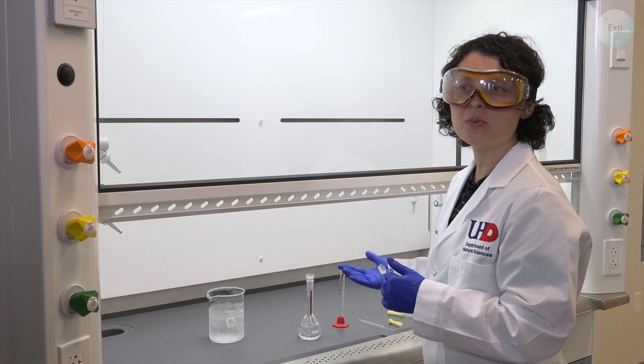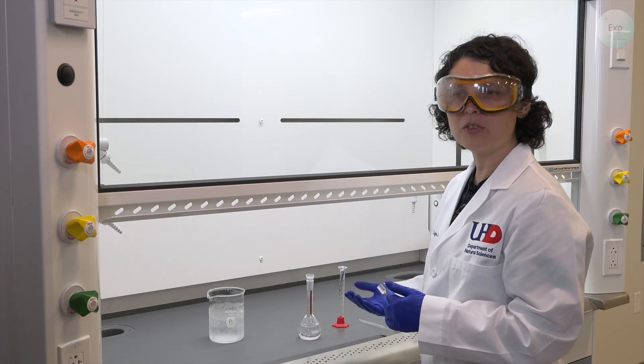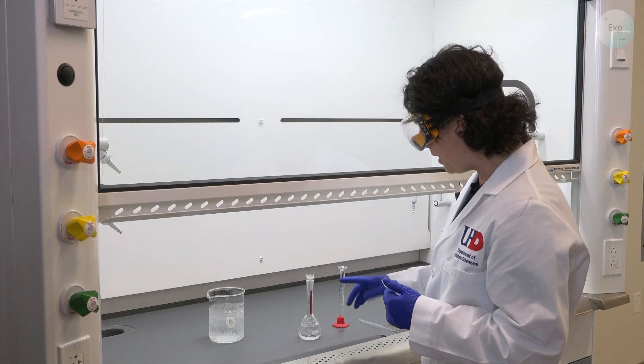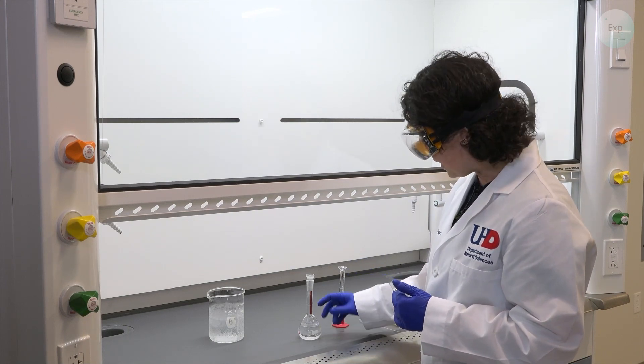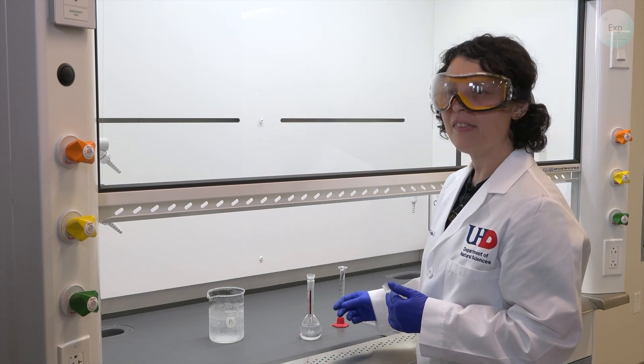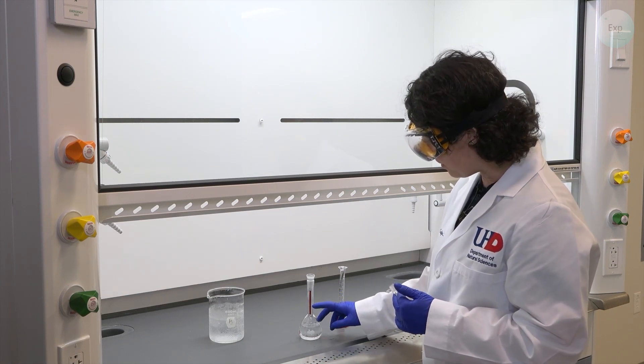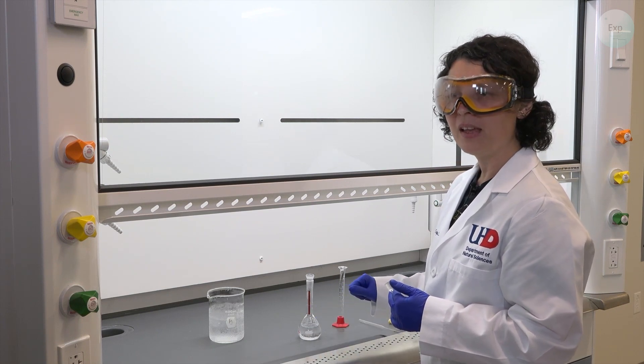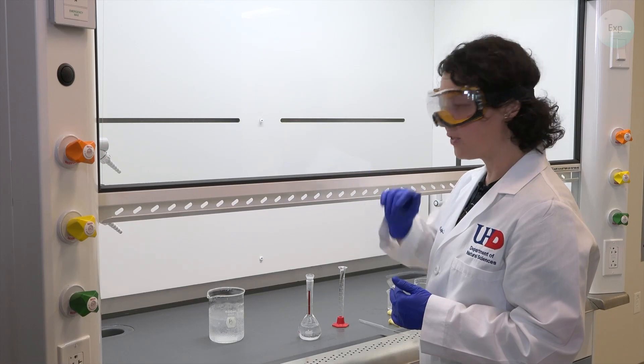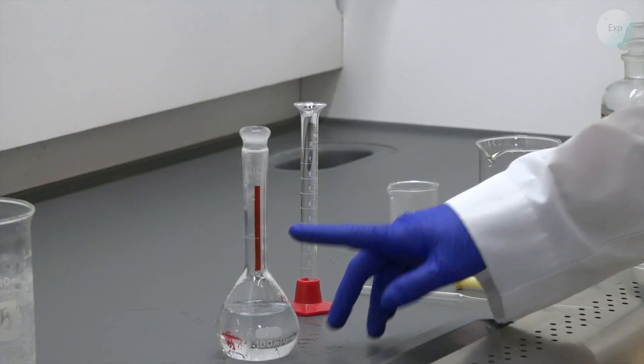So the solute is where it needs to be. The final volume of the solution isn't yet known. The only volume marker on a volumetric flask is this ring towards the middle of the neck. And that says when our volume hits that mark, it is exactly 100 milliliters. And we always want to get the meniscus of the solution to be at the marking.